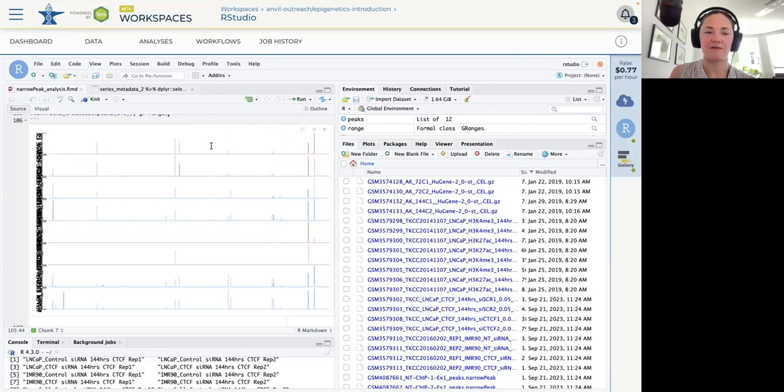But for the red samples, these peaks here in the middle are pretty low. And then here, they're almost completely gone. There's a little bit of one right there. But these ones on the outside seem to be much more present.